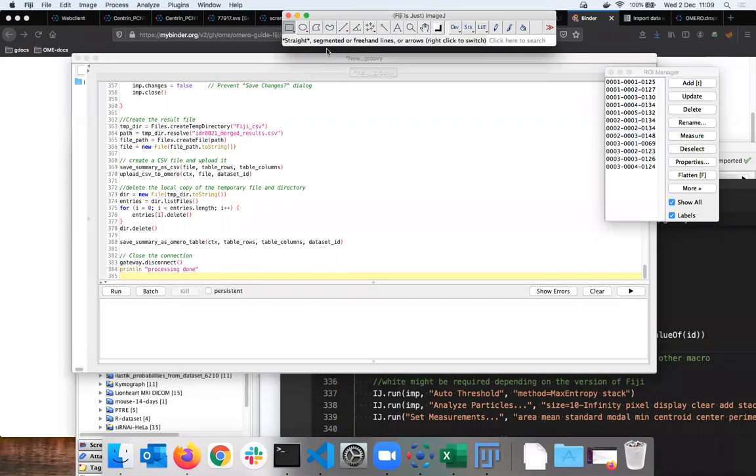What version of local Fiji do I have, which is sometimes upgraded, etc. And it will be fetching the images from the server in the university one by one, and then running the analysis on them, and then basically saving the regions of interest back onto those images, and there is kind of a long wait which is caused by the fact that I'm locally here on my broadband in a private flat in Dundee.